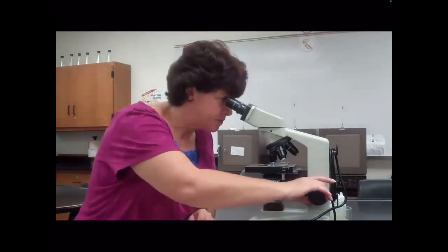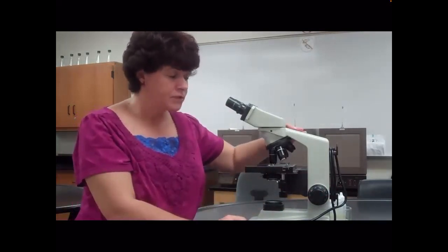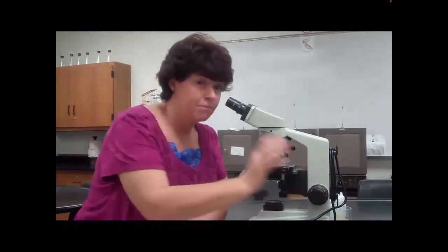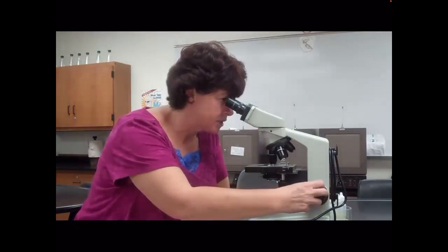Okay, so now I'm going to refocus by using my fine adjustment knob on my specimen. So now I found it with the 10 power. Okay, now I'm going to go to the 40. Notice that I do not move the slide. You may go, oh, it's going to hit. It's not going to hit. Okay, if you're in focus, these are parfocal microscopes. It's not going to hit. So now that I'm on the 40, I am not going to use the coarse adjustment knob. I can only use the fine adjustment knob. So my rule of thumb is, in most cases, if you focus away from yourself, it will come into focus. If it doesn't, try the other direction.